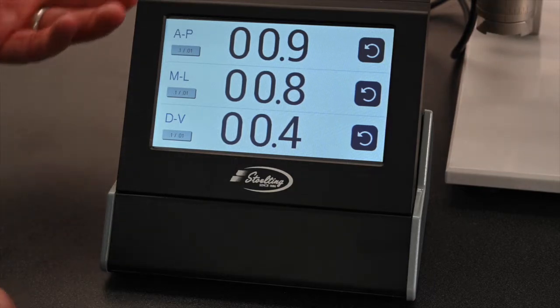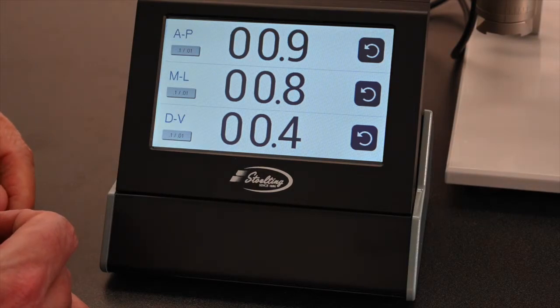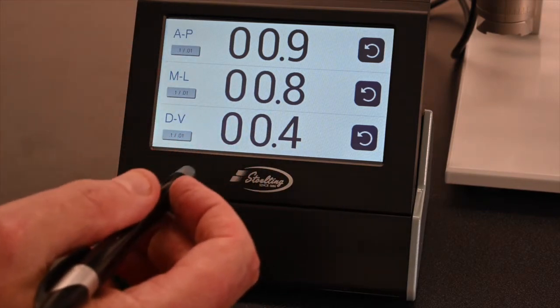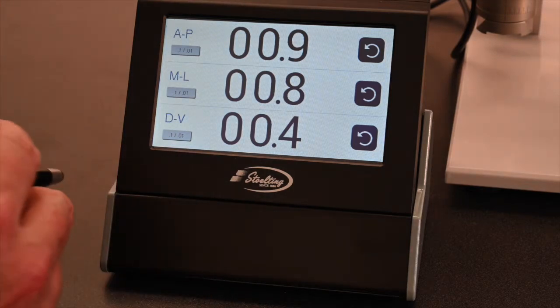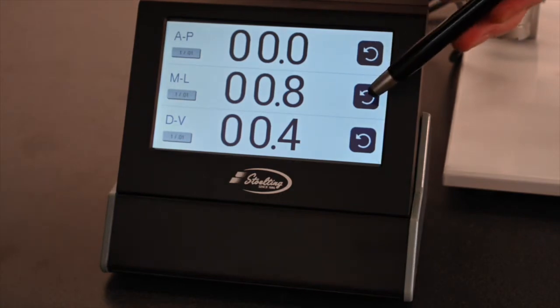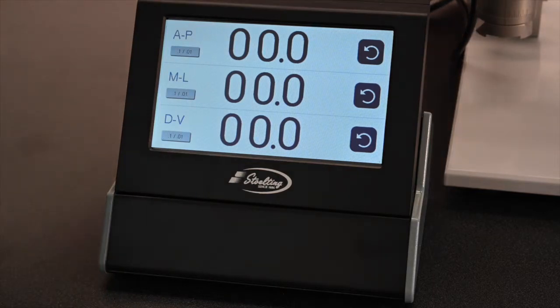You can drive each of your axes to your zero point — for most people, that's Bregma. Once you've opened up the animal and identified the Bregma location, you take your drill bit or syringe needle to that location, and that is what you call your zero point. We've created a way to simply reset your zero position, so when you need to move to your coordinates, you can simply move right to them.